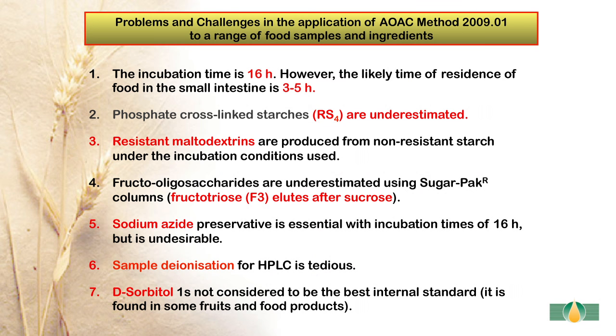The problems and challenges faced in the application of AOAC method 2009.01 to a range of food samples and ingredients are listed below. First, the incubation time is 16 hours, however the likely time of residence of food in the small intestine is just 3 to 5 hours. Secondly, phosphate cross-linked starches RS4 are underestimated. Thirdly, resistant maltodextrins are produced from non-resistant starch under the incubation conditions used. Fourth, fructo-oligosaccharides are underestimated using the sugar pack HPLC columns.